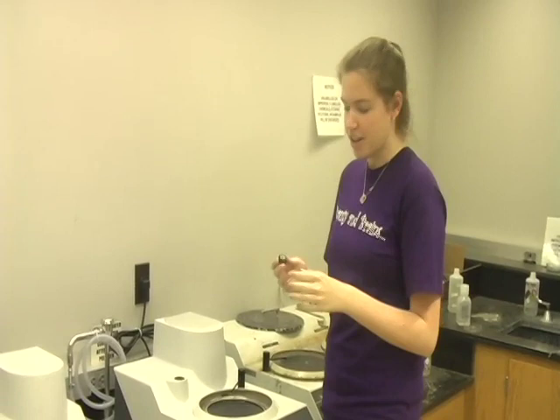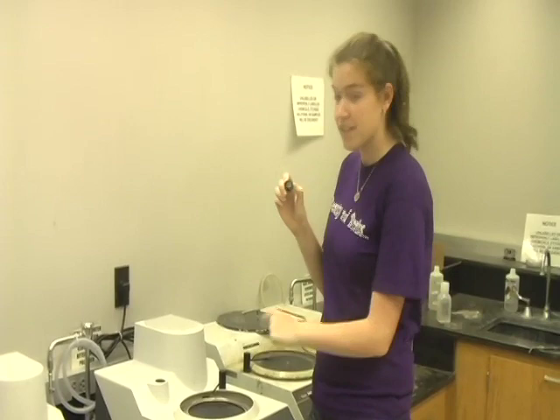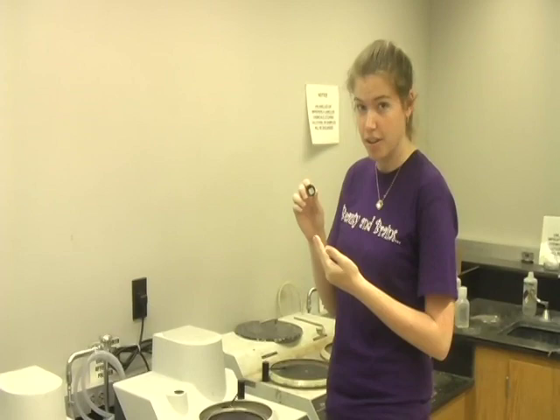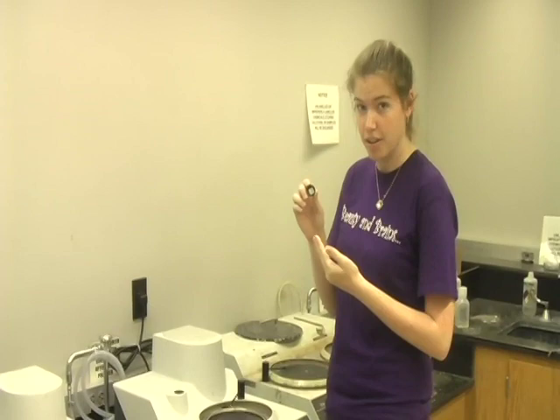Here's a helpful hint before we start: make sure that you hold your sample at a constant angle so that you get nice parallel lines from the center of your grit. It's a good way to know when all of your big scratches are out, because you'll have all of those nice even lines together. When you switch later on to another grit, you're going to turn it 90 degrees. That will also let you see when all of the old scratches are out, because you'll have new parallel lines perpendicular to your old ones.